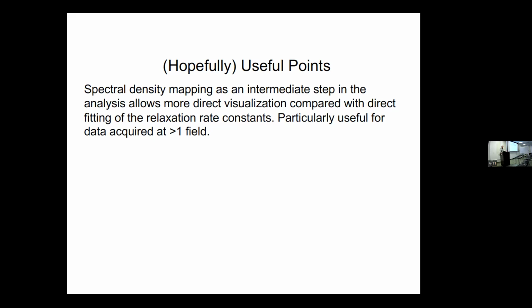And in what's called reduced spectral density mapping, you make the assumption that all the frequencies near the hydrogen frequency, which would be the zero quantum, the double quantum, and the single quantum J omega H, are all high enough frequency that you're in this 1 over omega squared regime, so that they can all be modeled with one parameter that depends on a quadratic function of 1 over omega squared.